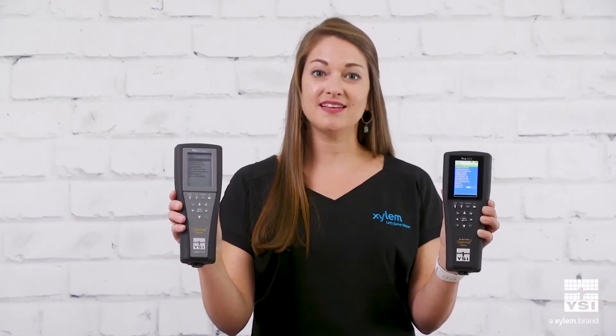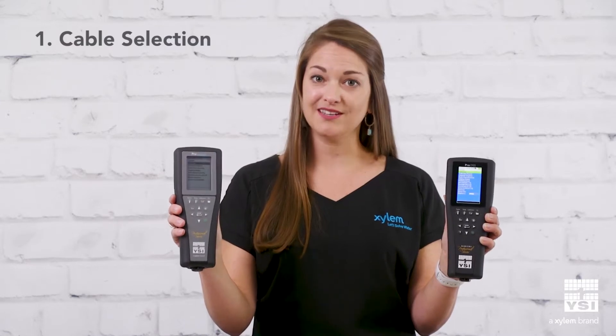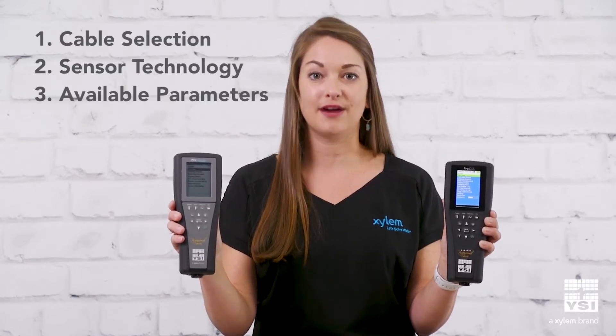The major differences between these handhelds involve cable selection, sensor technology, and the available parameters.